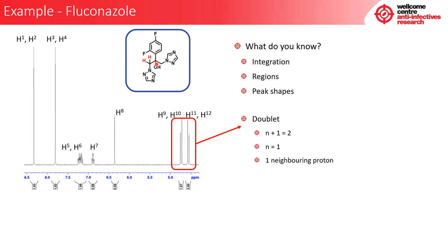But what we said before about some NMRs is that they have the ability to detect geminal and vicinal coupling. Vicinal meaning neighbouring, geminal meaning attached onto the same carbon. And perhaps what we are seeing here is geminal coupling. But we want to use further NMR experiments to help us make that conclusion. So let's now look at another peak.